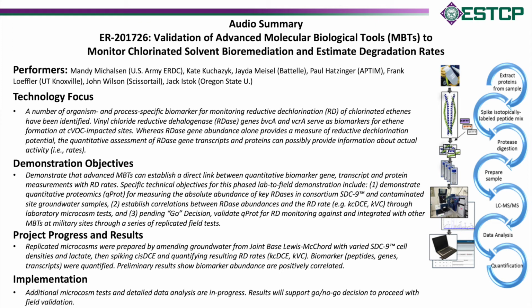By knowing what these enzymes do, and by determining their absolute abundances in groundwater, we are able to determine if enzyme abundance can be used to predict biodegradation rates. In other words, our approach is to correlate the abundance of specific protein biomarkers with degradation rates, which will provide crucial information about the cleanup time required to meet regulatory standards. Such a rate predictive tool would transform how we assess monitored natural attenuation and bioremediation, and would make remediation outcomes much more predictable, which will streamline site cleanup.